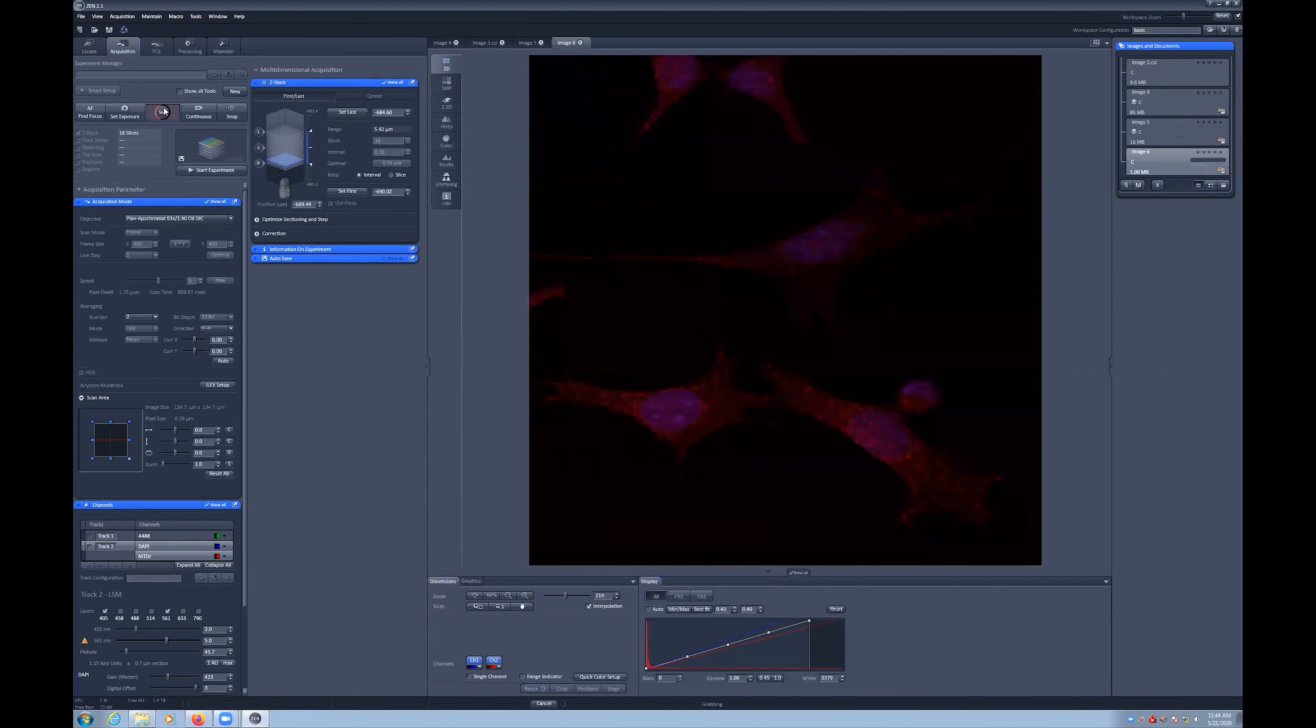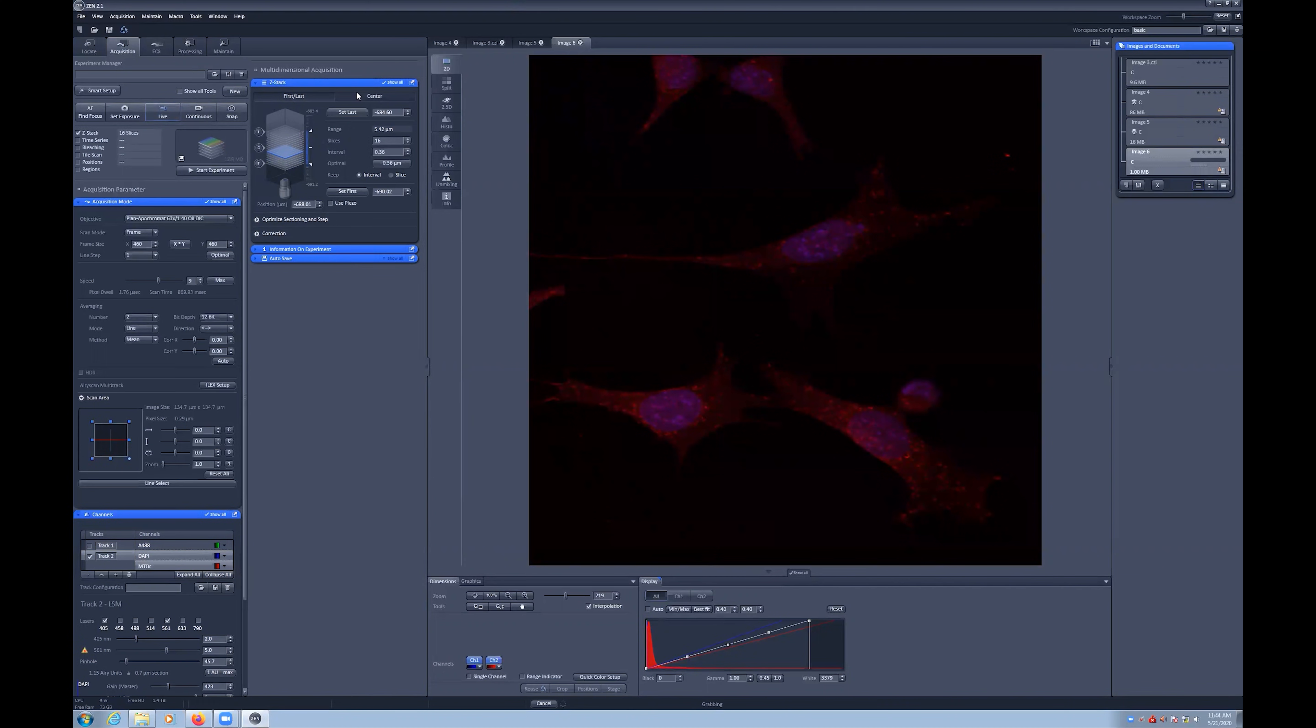Next we can get a new image on the screen by running live. We can then stop this and select Center Mode in the Z-Stack menu.